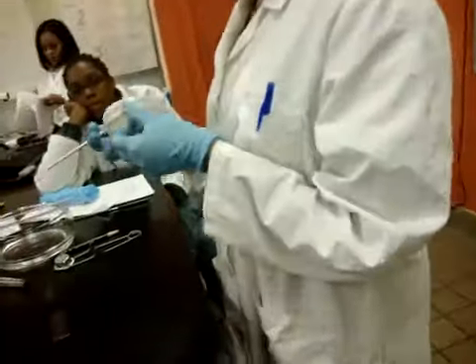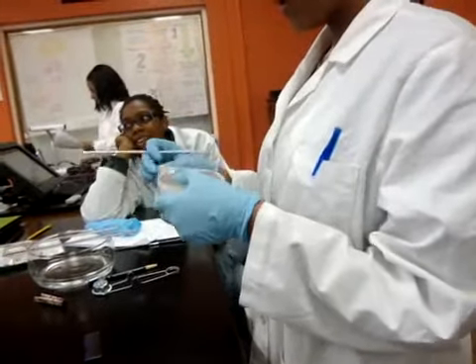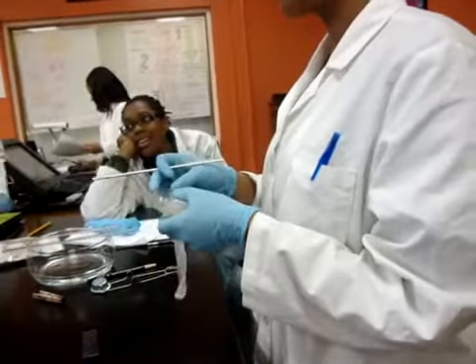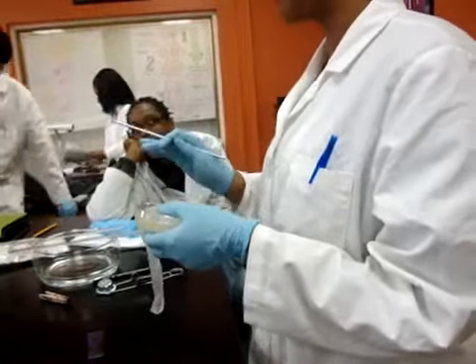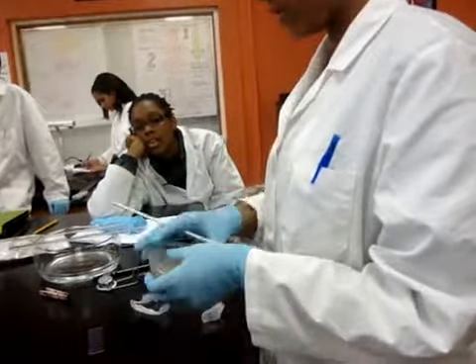Then I'm going to open up my bacterial sample. Now you can use the same piece of parafilm to wrap it between your group doing it, but at the end you should put a fresh piece of parafilm around it, at the very end.